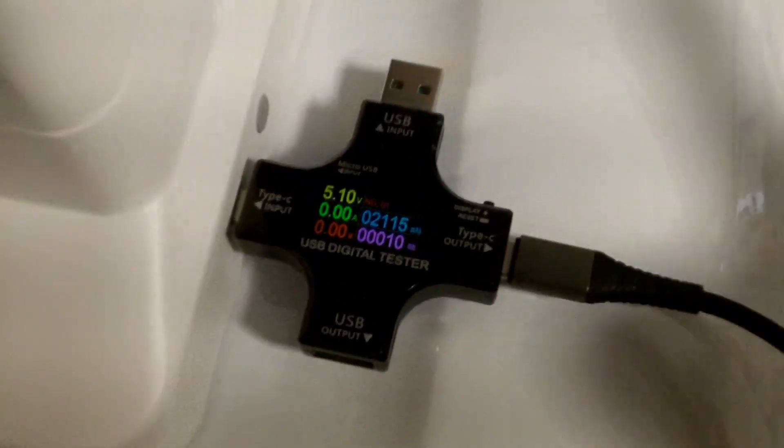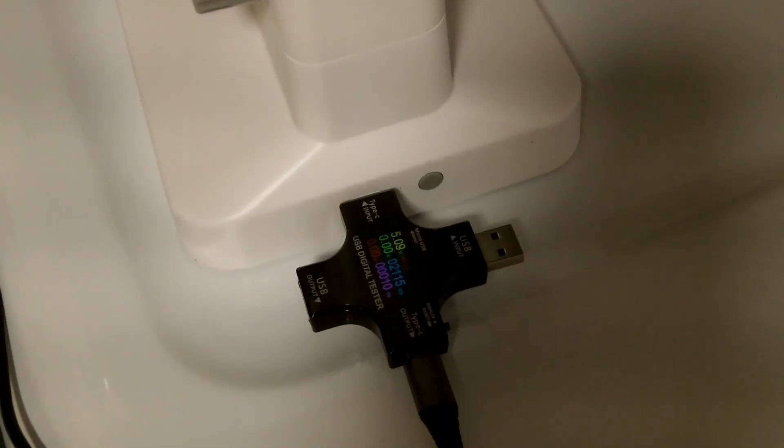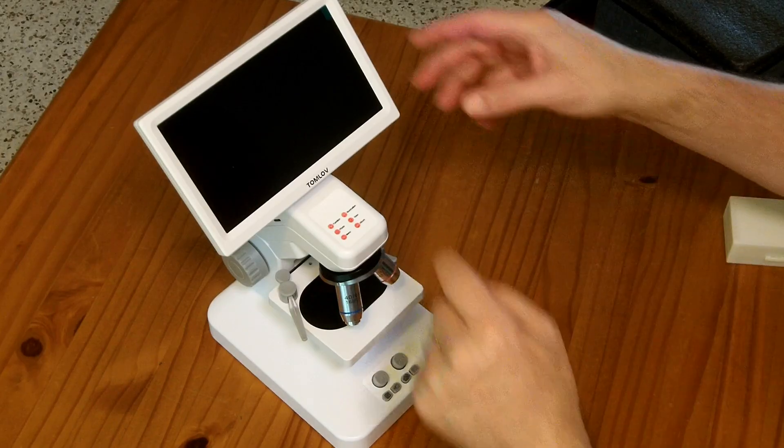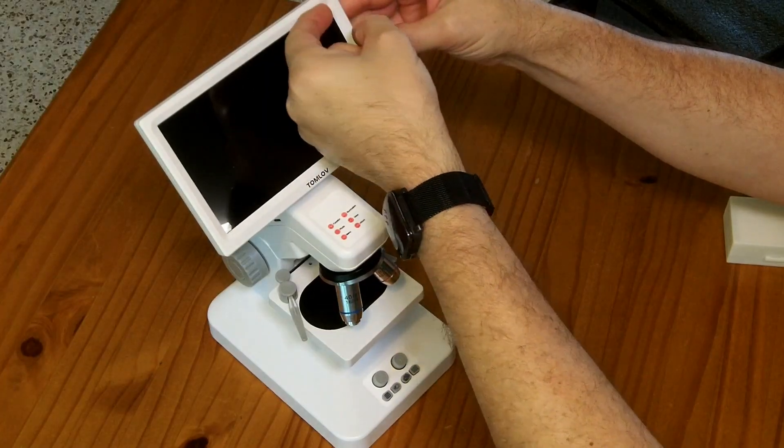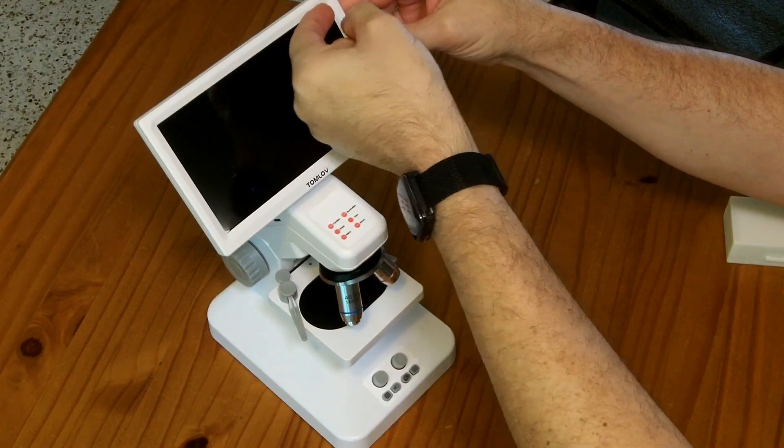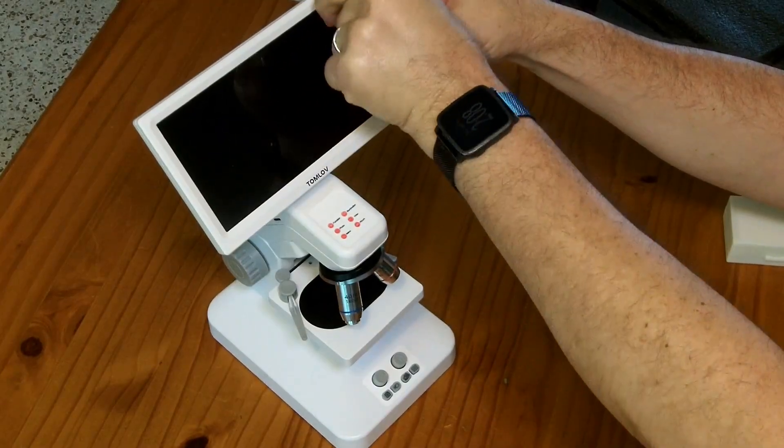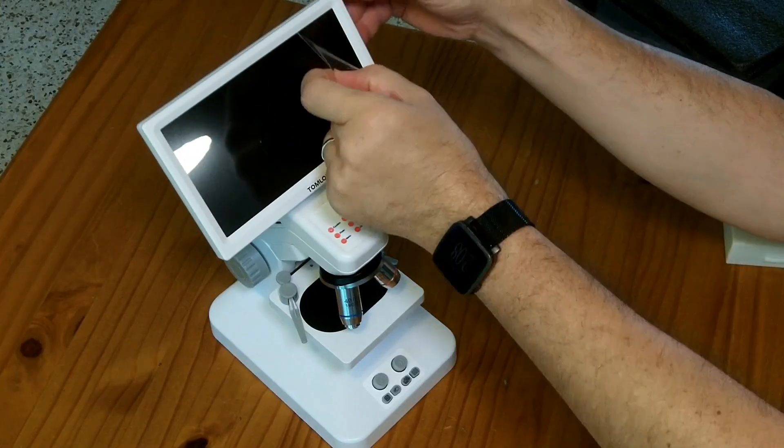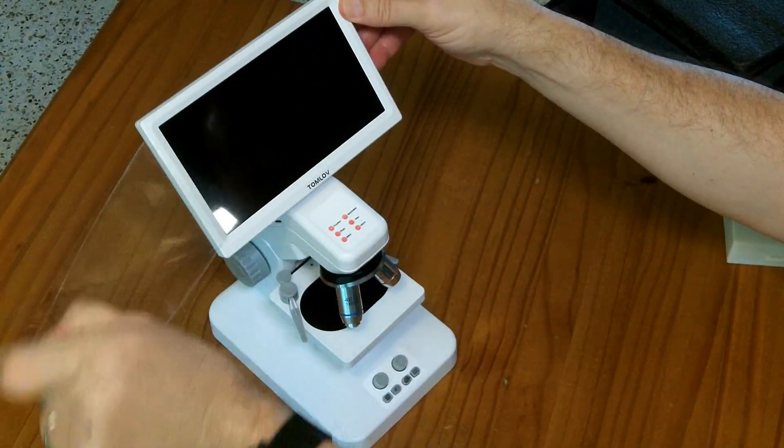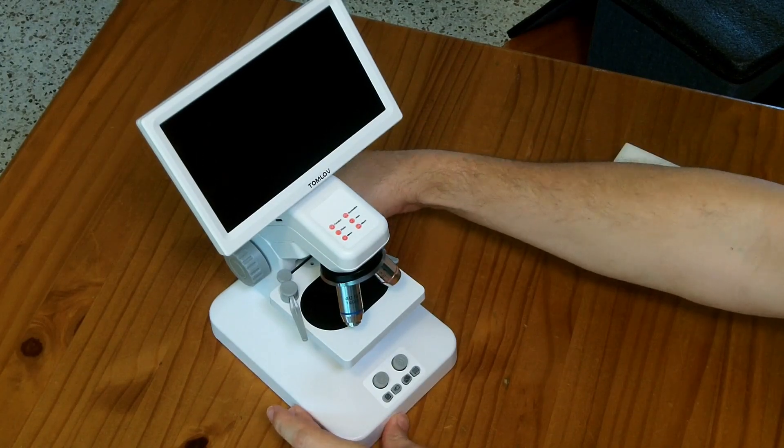The red light turned off. And it took 10 watt hours to fully charge this guy, so I'm going to say that the battery was completely discharged in the box. Let's put this guy through its paces. There is a piece of green tape on the corner here, which I believe is to pull a protective plastic off of the screen. Okay, take the plastic off. It wasn't easy to grab that guy, but I got it. Pushed the button on the back, and the light came on.